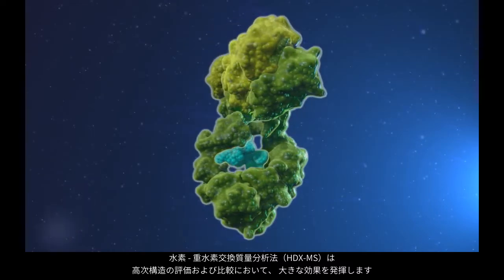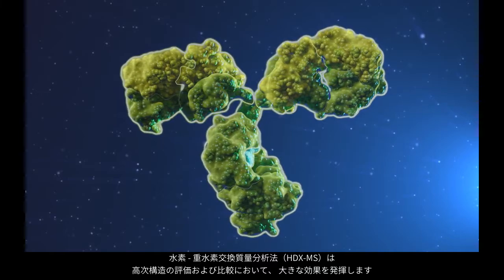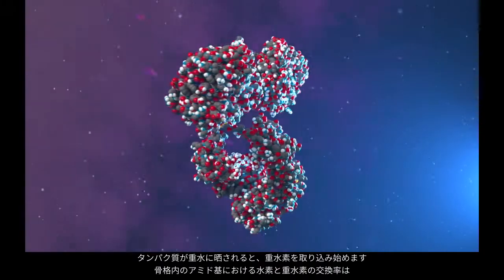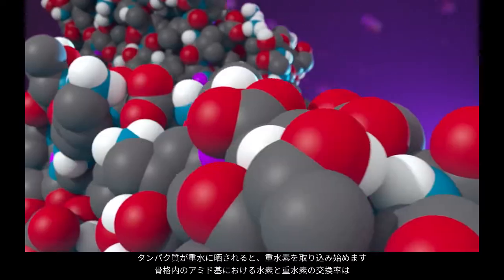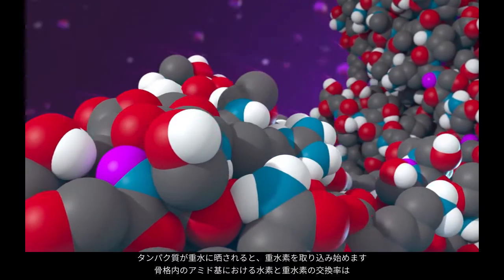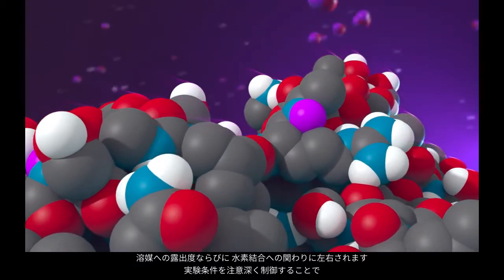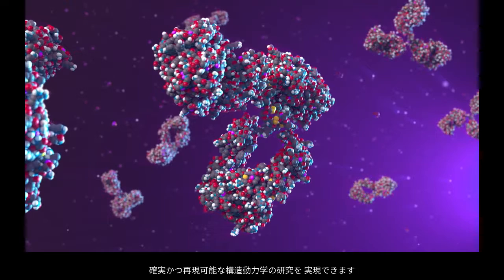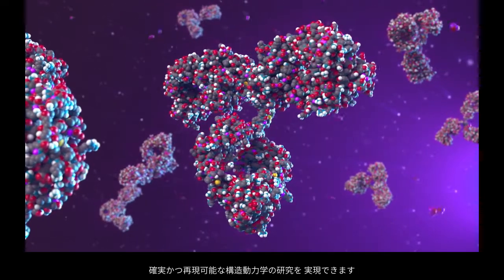Hydrogen-deuterium exchange with mass spectrometry, HDX-MS, is a powerful method for assessing and comparing higher-order structure. If the protein is exposed to heavy water, it will begin to accumulate deuterium. The hydrogens on backbone amide groups exchange with deuterium at a rate that depends on solvent accessibility and involvement in hydrogen bonding. With careful control of experimental conditions, this allows reliable and reproducible study of conformational dynamics.